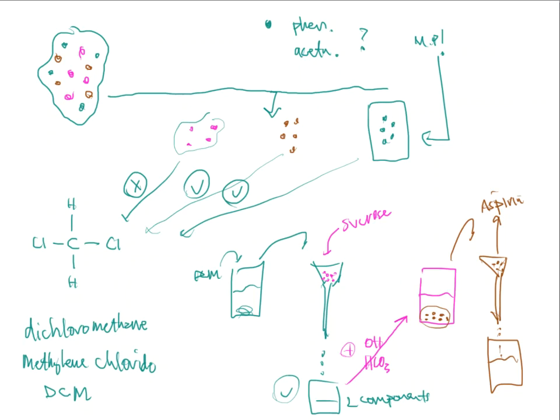Okay? So that means in this step, I'm going to put this on a hot plate, crank up the heat a little bit, and allow the hot plate to drive off the methylene chloride fumes. And when all of that gets driven off, I'm going to be left with a cruddy, solid residue in my container. Now, the methylene chloride, you probably don't want to breathe it in. So we encourage you to do this under the hood. Whenever we evaporate solvents, if they're organic solvents, we encourage you to do it underneath the hood when you can.